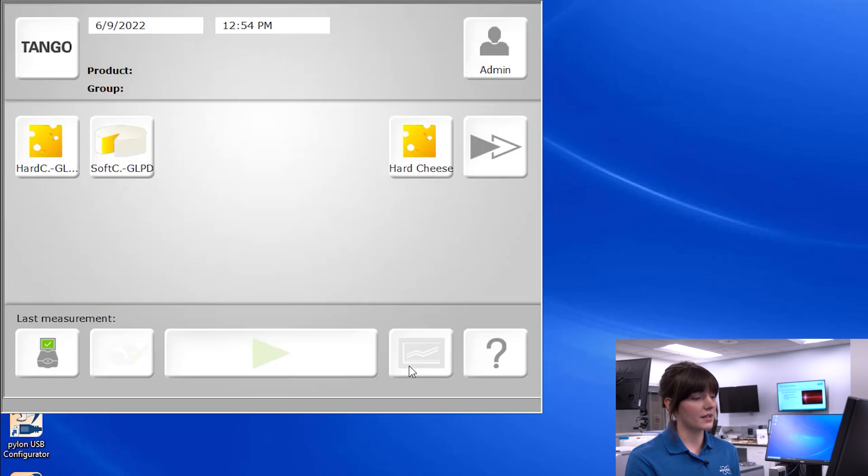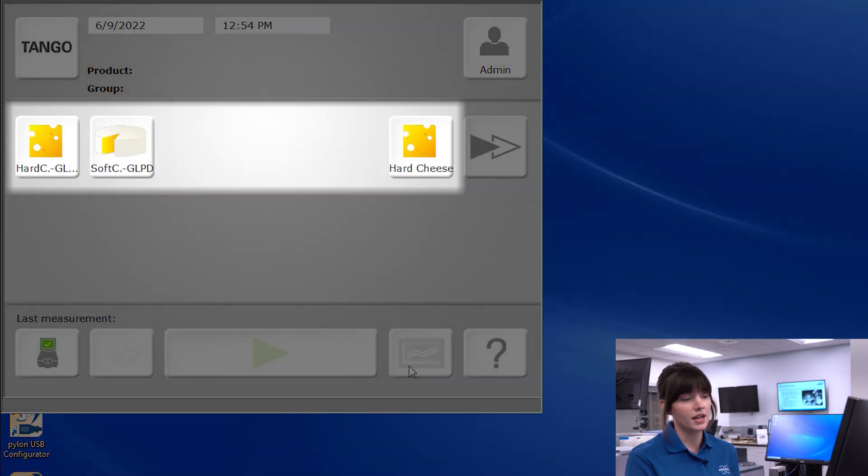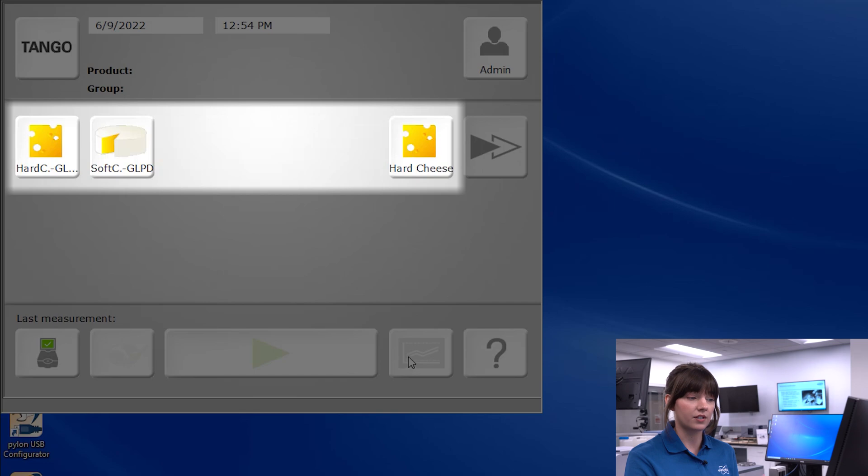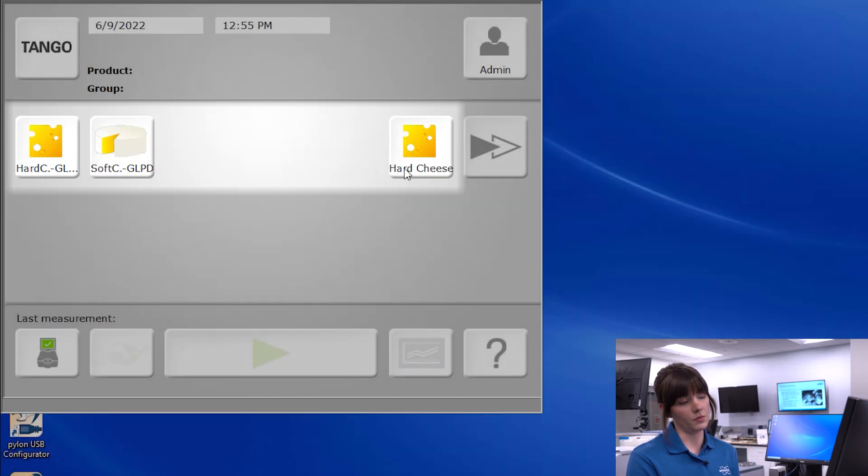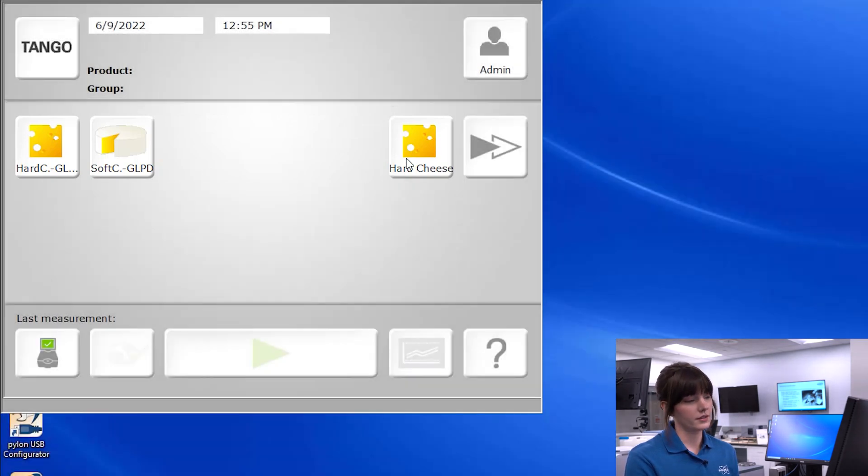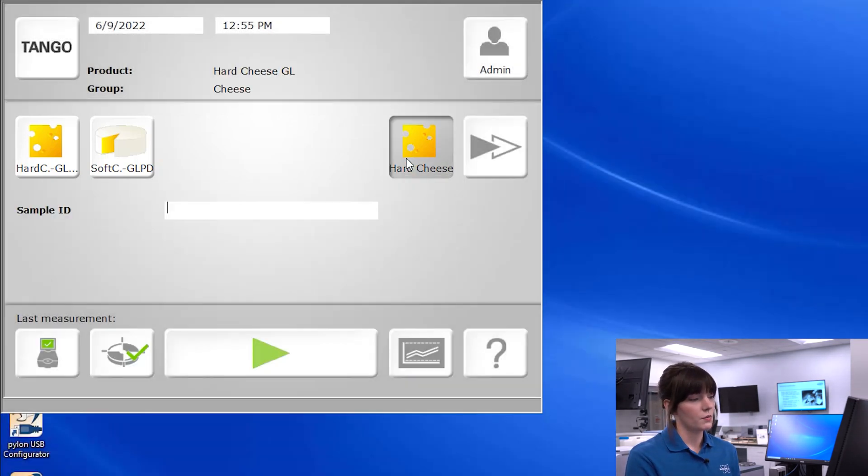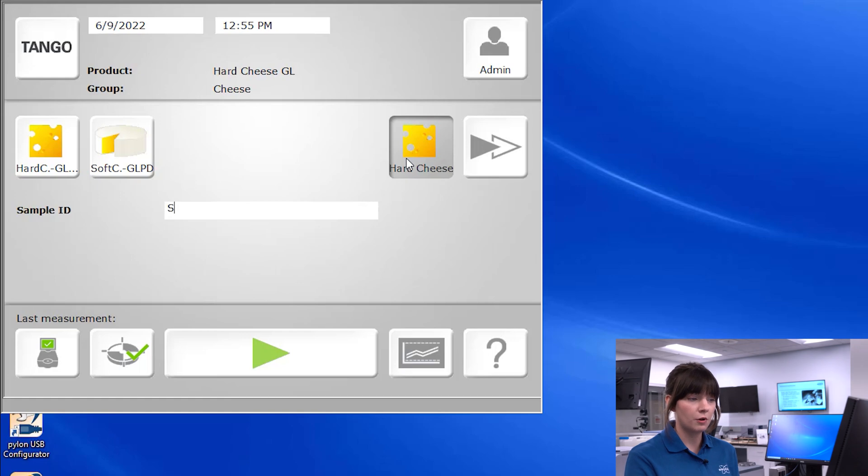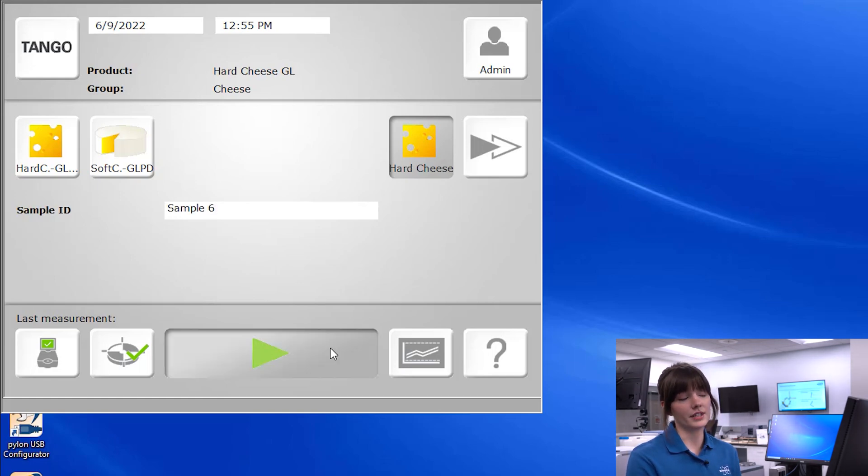As we navigate back to the main screen, we see it's displaying different products, either up to six products that we selected as favorites or the products we've most recently run. When we're ready to scan a sample, we select the appropriate product, input the identifiers for the sample, and simply hit go.